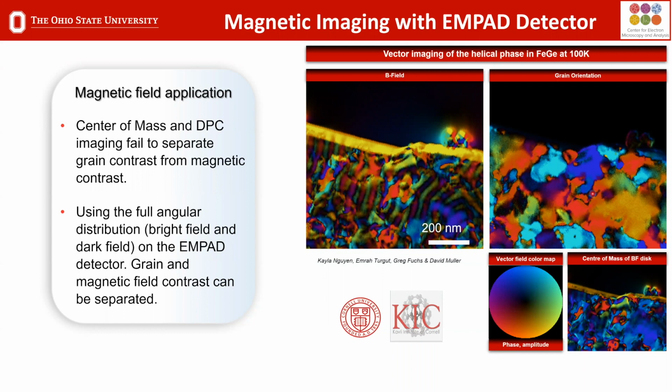And so while this provides more information, which may be useful for some experiments, there are other experiments, like looking at gallium nitride, where you need 63 picometers of resolution. You can't focus on that with a slow raster that you would get from the EMPAD. So imaging something like that on the EMPAD can be more difficult than on the 4-segment detector. But for things where the image is complicated and the signal is convoluted, the EMPAD gives you all of the information. And now with our customizable virtual apertures, we can pull out the information we want.